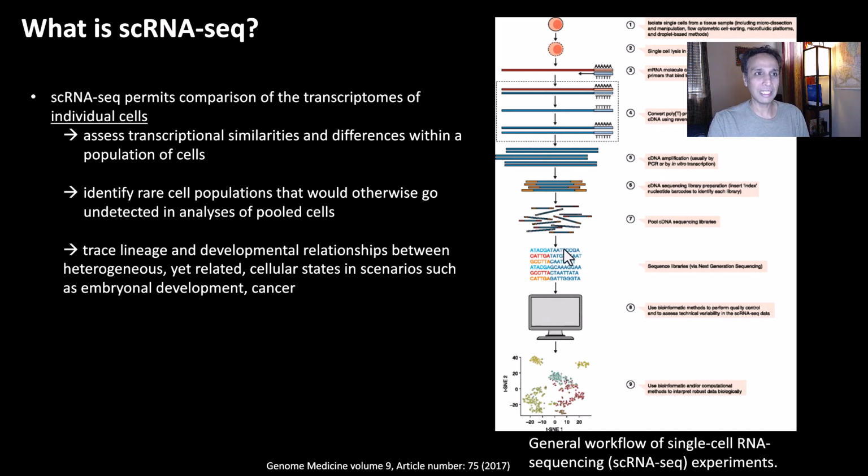So all of this is for your sequencing. At the end of it, what you would get, as I mentioned earlier, is a data set of each cell, where the cell is located, and for each cell, what genes are present in that specific cell, because you're reading this down to a cellular level. Again, you get more information.